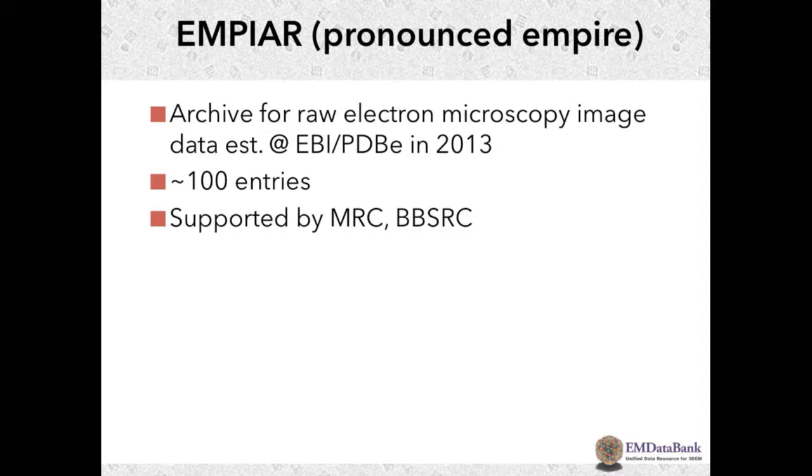So the purpose is different. Having this particular archive allows you to make benchmark data available, which has been a difficulty because of the large sizes of the data sets.